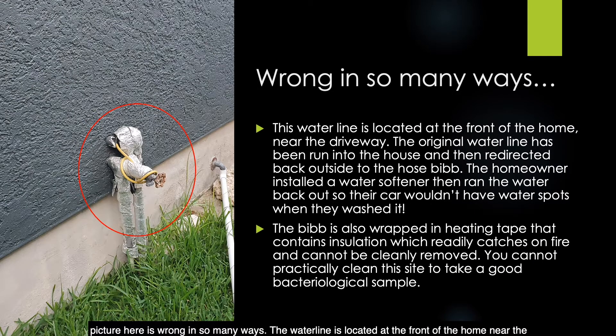The hose bib pictured here is wrong in so many ways. The water line at the front of the home was run into the house and then redirected back outside — it turns out the homeowner installed a water softener and then ran the water back out so their car wouldn't have water spots when they washed it. The hose bib is also wrapped in heating tape with insulation that readily catches fire and cannot be cleanly removed. You cannot practically clean the site to take a good bacteriological sample. Evaluate the water from hose bibs prior to adding them to your sample siting plan and check for household treatment such as a water softener.